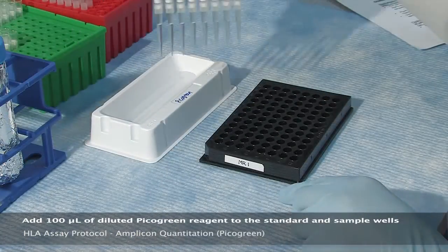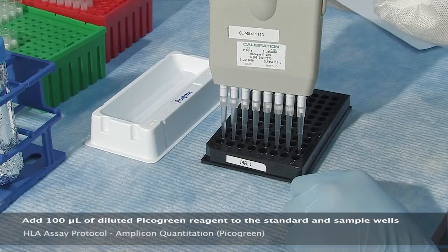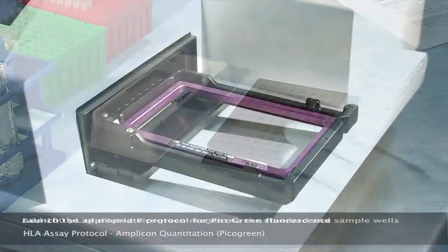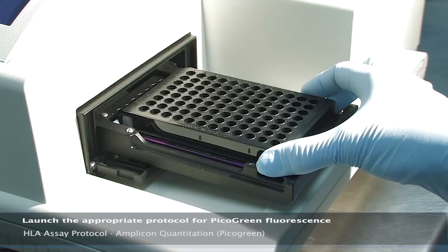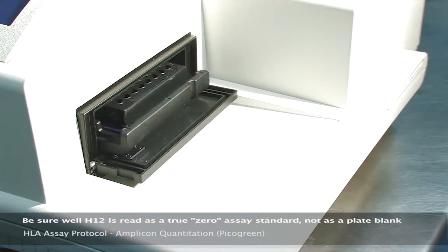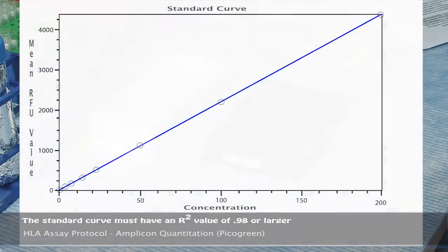Using a multi-channel pipetter, add 100 microliters of diluted PicoGreen reagent to the standard and sample wells, pipetting up and down three times to mix after each addition. Place the 96-well plate on the fluorometer and start the program. Launch the appropriate protocol for quantitating double-stranded DNA by PicoGreen fluorescence, and make sure that well H12 is read as a true zero assay standard, not as a plate blank.